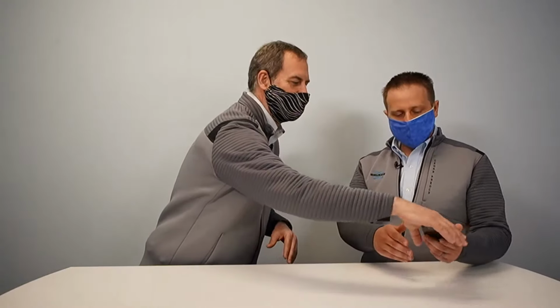In terms of length, I know that there's also a fancy feature called helical scanning. That is correct. Helical scan, basically, instead of rotating your sample at one fixed height, it actually runs your sample through a corkscrew. Okay. And what that does is it allows you to image all the way through that field. So you can do something like your phone, right? Where you can image this. Right. And it also helps in imaging. There's other techniques with this helical scan which help to make your images sharper, especially if you're trying to look at something flat like this. The helical scans actually give you much better data.